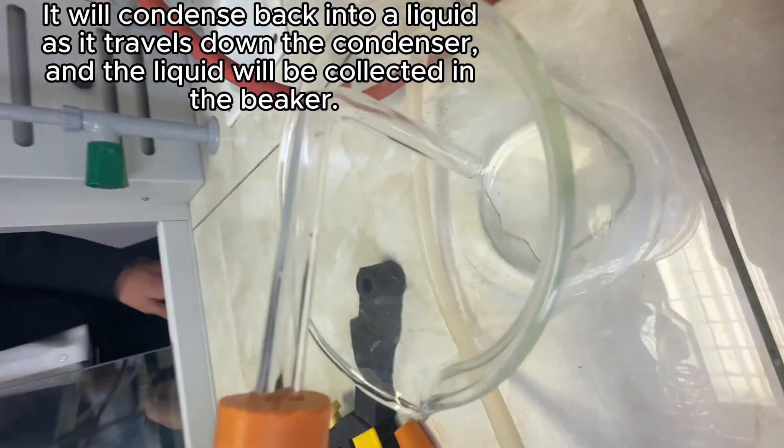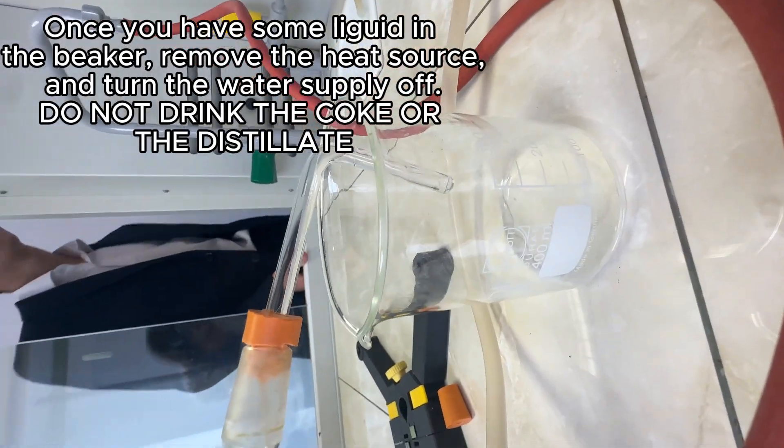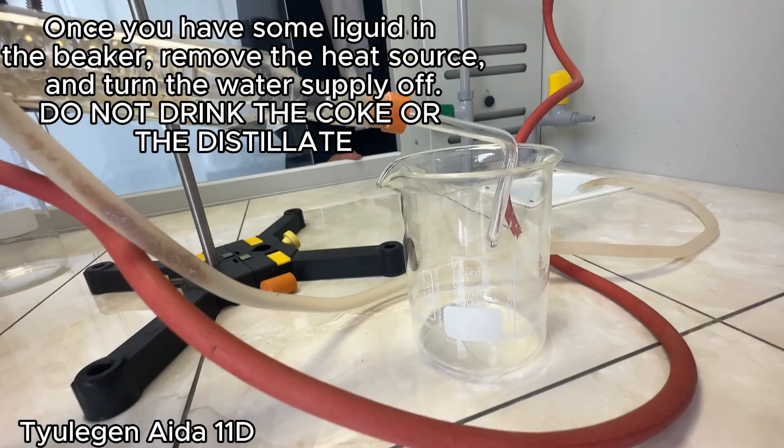Once you have some liquid in the beaker, remove the heat source and turn the water supply off. Do not drink the cola or the distillate.